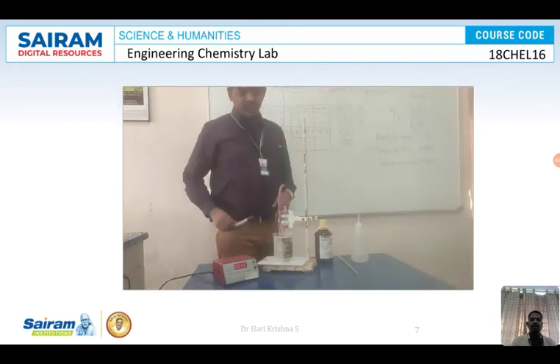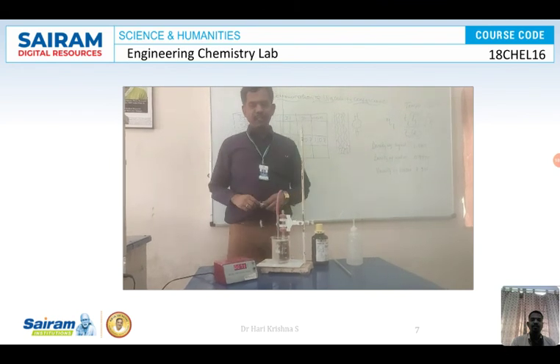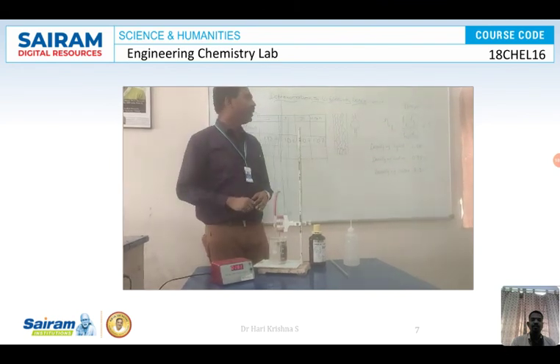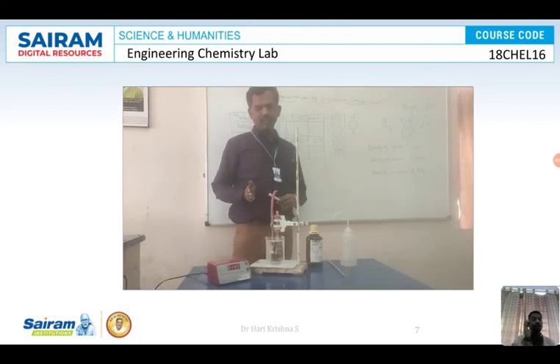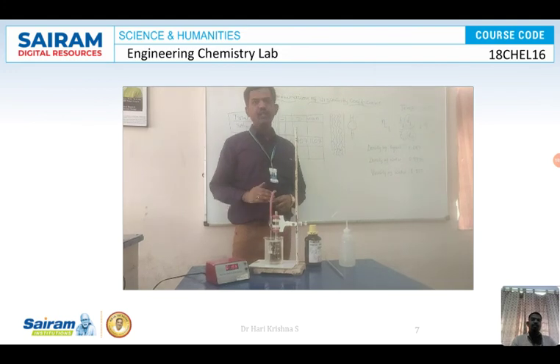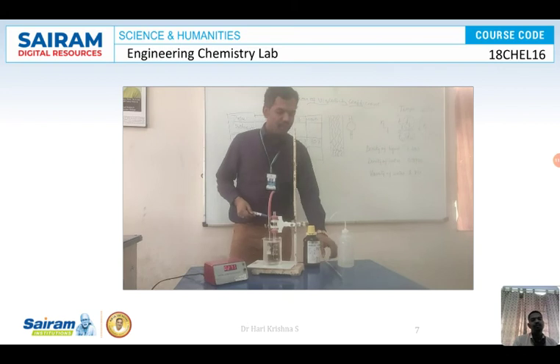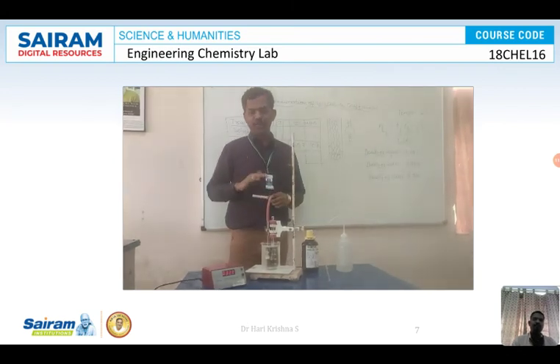We are going to use the same viscometer and same pipette because we are comparing the rate of flow of liquid with that of water. This is a comparison. Therefore, we use the same viscometer and same pipette for water as well as for liquid. If we use a different viscometer, the rate of flow will change because the capillary varies from viscometer to viscometer. We use the same pipette because the volume taken also varies. So I am going to take the same.